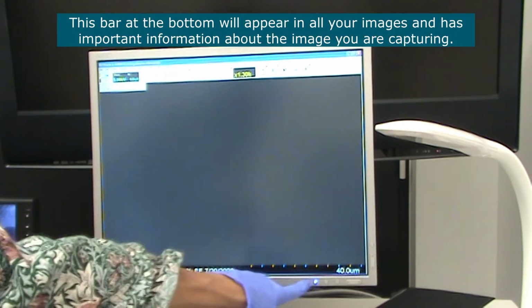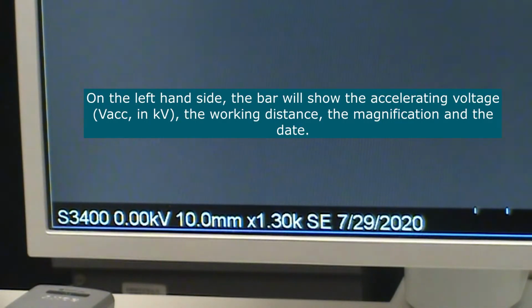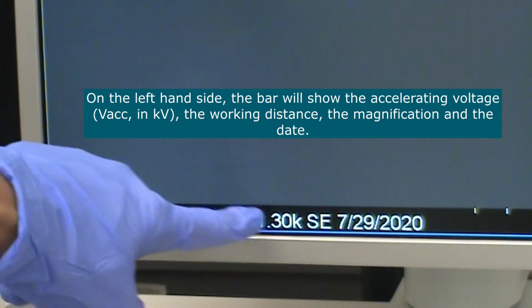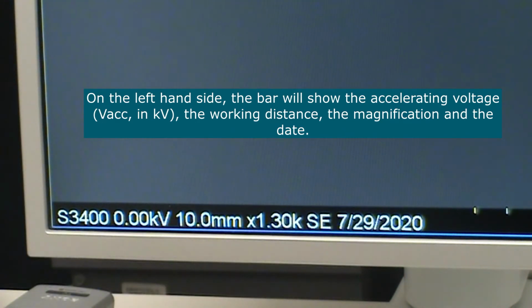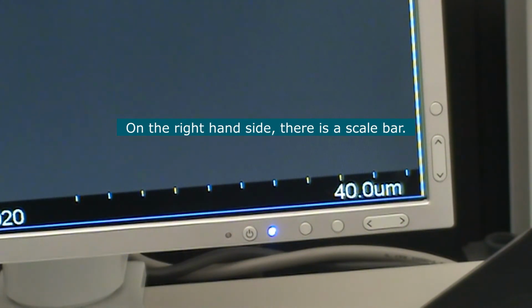Let me just walk you through some important details in the interface of the microscope software. So here at the bottom, this bar will appear in all your images, and it has important information about the image that you're capturing. On the left-hand side of the bar, it will show the accelerating voltage, the working distance, and also the magnification of your sample, as well as the date. And then on the right-hand side, there's a scale bar.